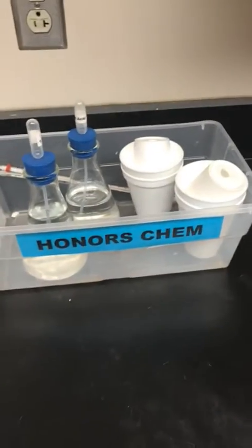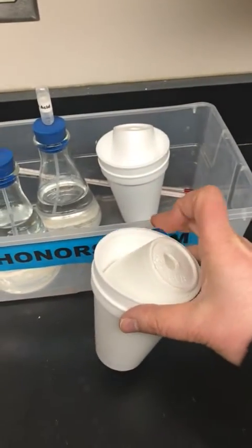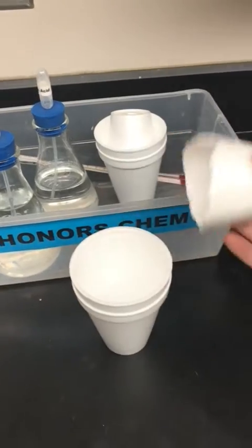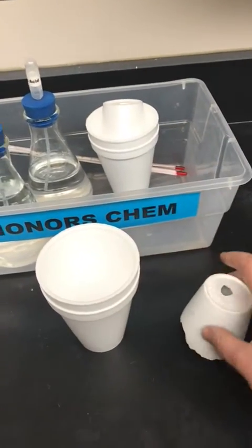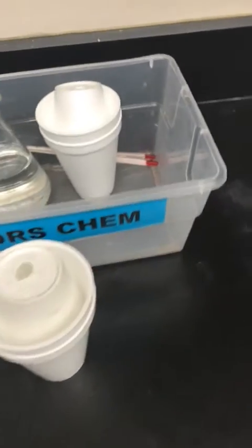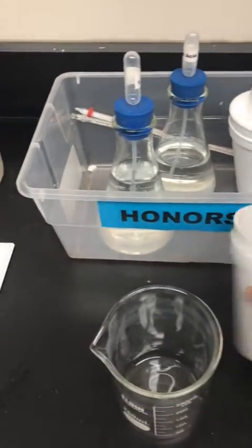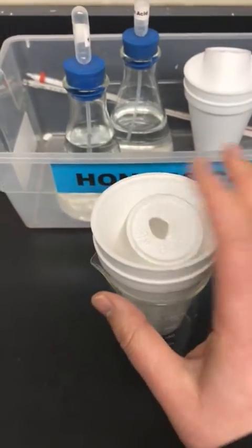So if you look at the bin at your lab station, you will find what we call a coffee cup calorimeter. It's made up of 2.5 styrofoam cups. You have 2 styrofoam cups just to provide some insulation, and then half of a styrofoam cup with a hole on top of it as a lid. You might need to get a beaker from your drawer so that you can put this in it. That way it is just more stable and doesn't get knocked over.